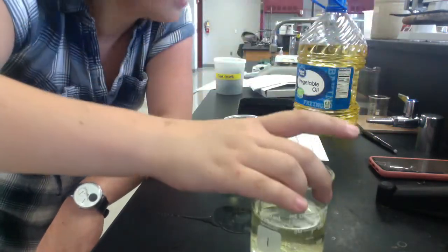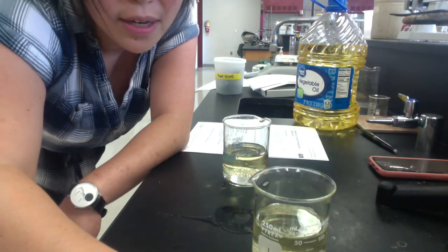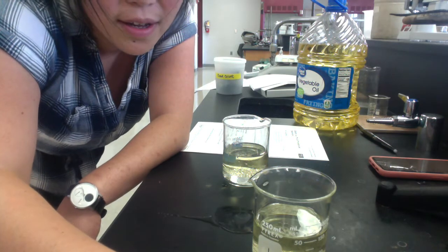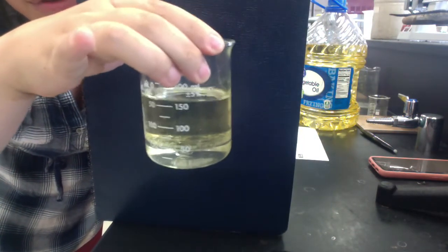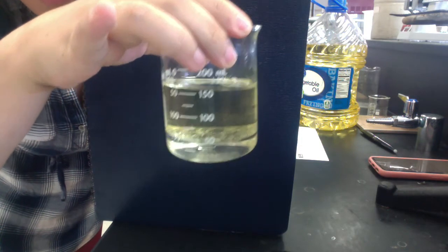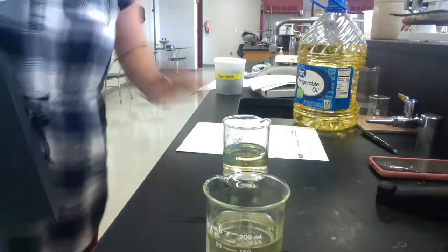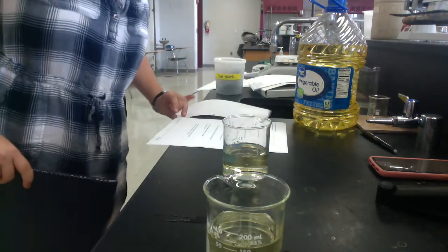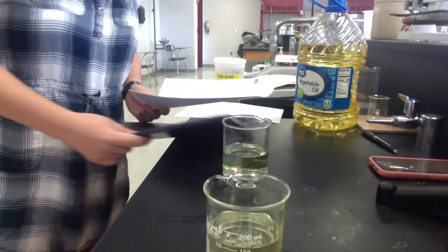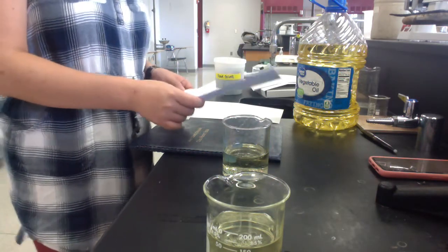Let me hold up something real quick. Apparently there's no pause button here, which is unfortunate. If I use a dark background, you should be able to tell that there are two very distinct layers. Which one is which? So then, which substance has a higher density? Explain your reasoning.